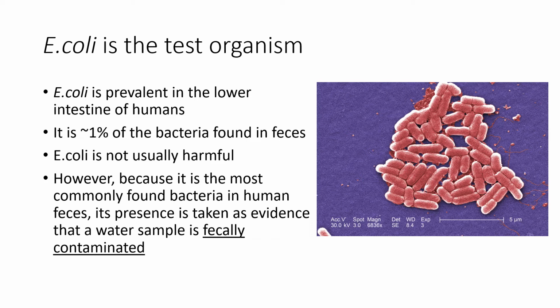So we test water samples for E. coli in the coliform analysis to see if that water sample has feces in it. I am not concerned necessarily with the E. coli. In most cases, E. coli is no problem whatsoever. Of course, there is the E. coli O157. Every once in a while, you hear about it. I think the last time it was in spinach. Sometimes it's romaine lettuce. It was melons not that long ago, probably 6-8 years ago at this point.